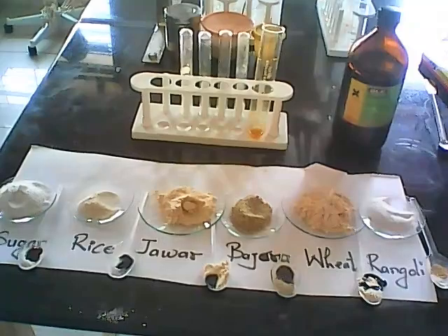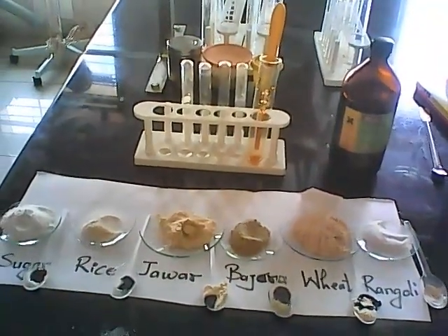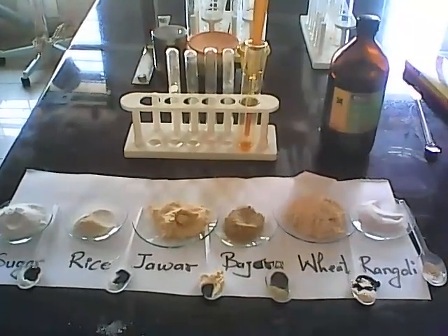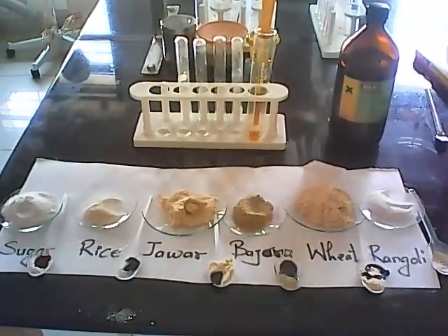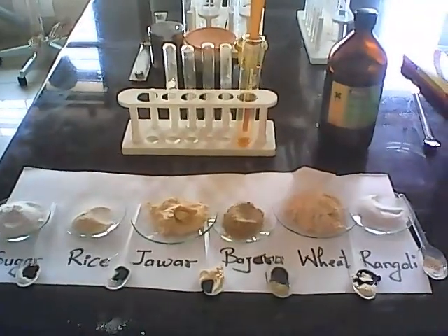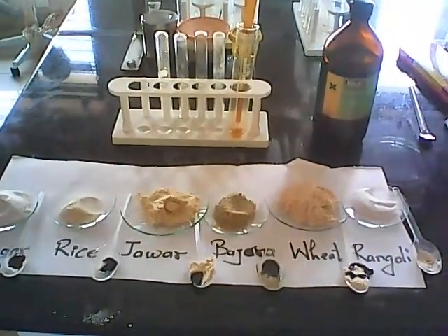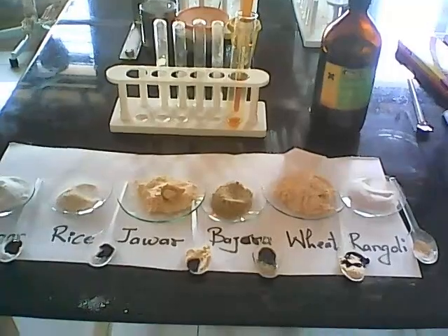Okay. So here for the detection of carbohydrate we have performed the same activity. You can see that the color of the samples like sugar, rice, jawar, bajra, wheat and rangoli in the spoon has changed. You can see the sample in sugar, rice, jawar, bajra spoon has changed to dark purple color or brownish color.